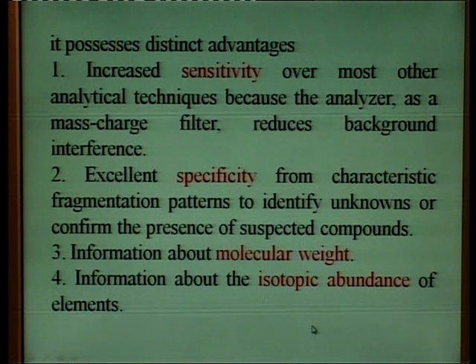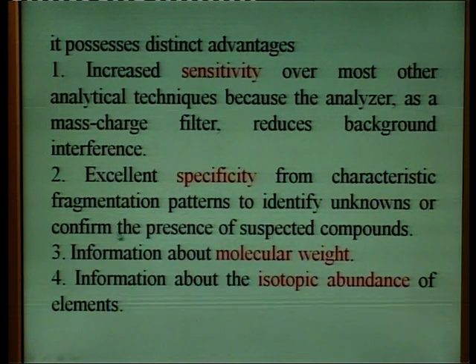Now, it has four distinct advantages over the other methods. First, it is more sensitive than other methods, because here we use the mass over charge ratio. It has excellent specificity, which is determined by the fragmentation pattern. Every fragmentation pattern of any compound is distinctive of itself. No other compound gives that type of fragmentation pattern.